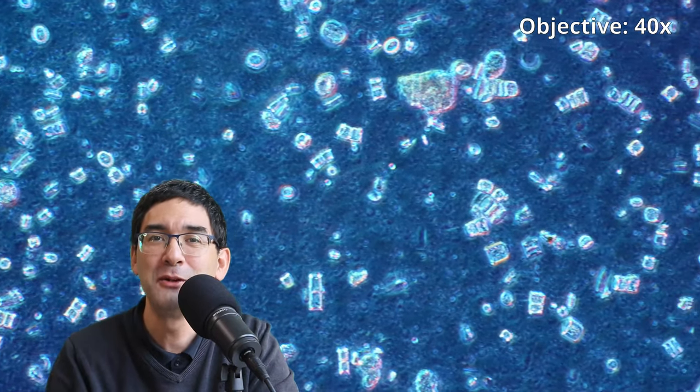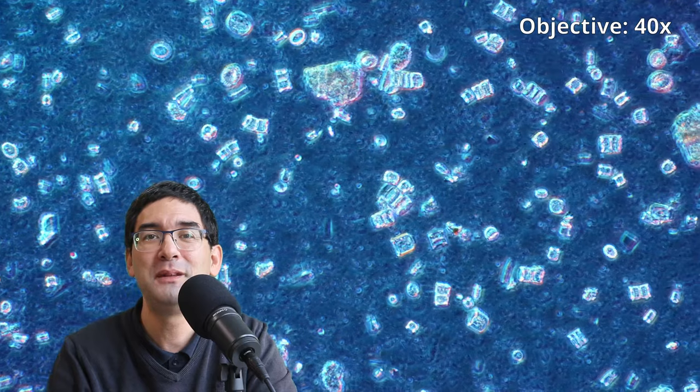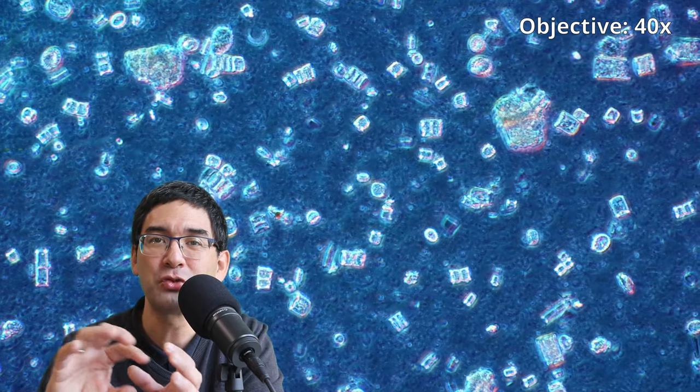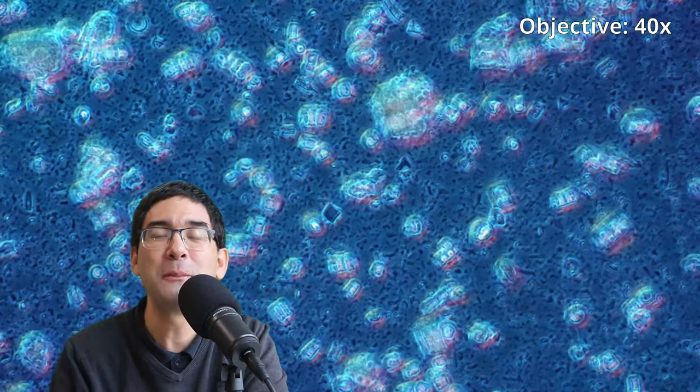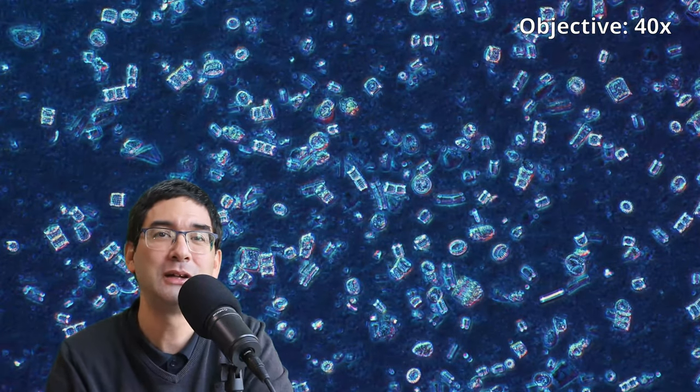So this here beautiful picture again is using phase contrast microscopy, which allows you to see that the diatom frustules are bright on a darker background. So you can use different microscopic techniques to experiment around here a little bit.